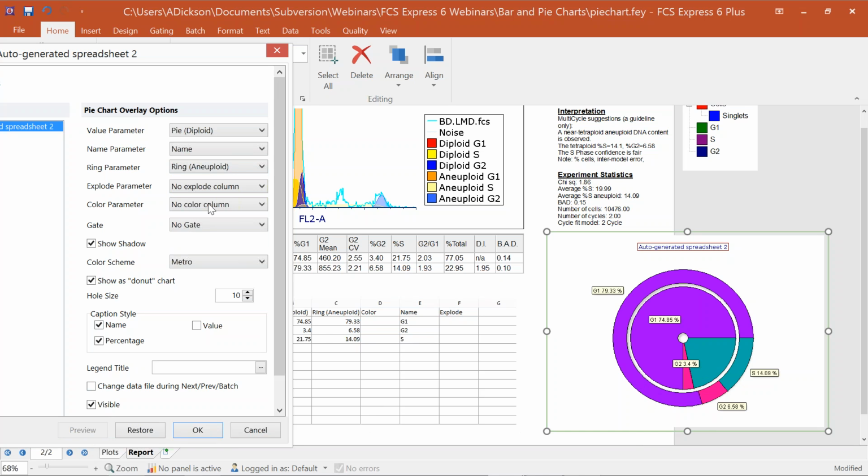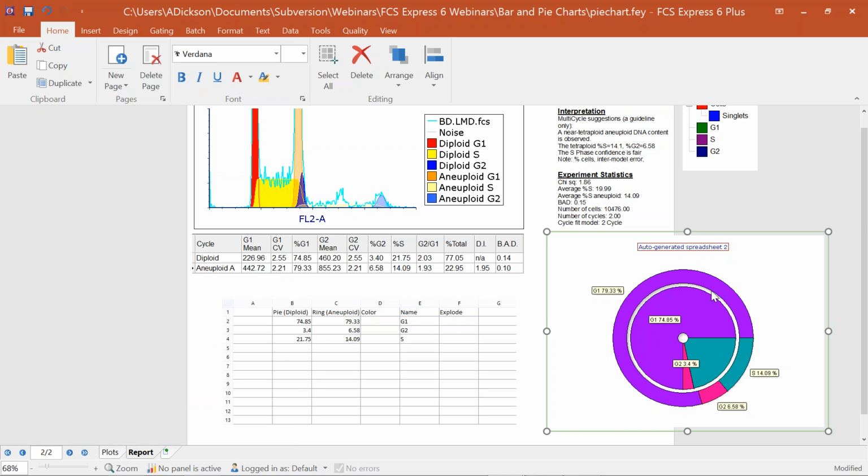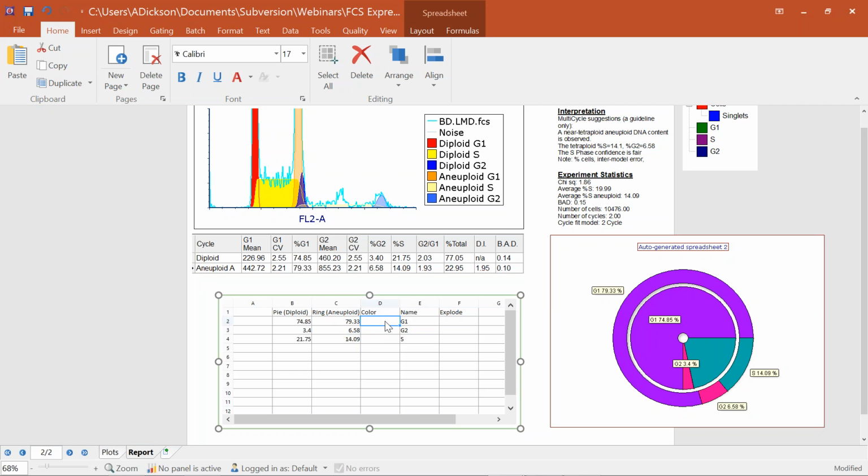There it is there. And just keep on going through. I'll activate my explode settings, and then we'll build in the conditional statement for that. And also I can switch this to color, and I'll say preview. So now those are actively applied from my spreadsheet onto here, and you'll see I can actually type in free text to change the color of these different charts if I wanted to. If you actually want to use a gate token, you can do that. So colors of gates can be reflected and updated in your pie chart.